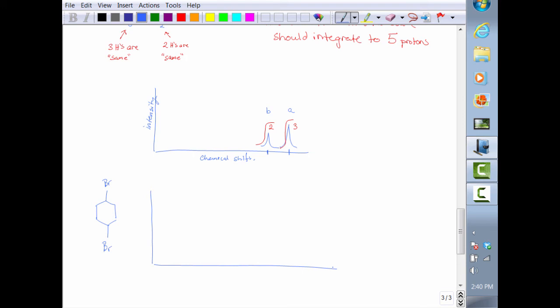There's actually only 2 types. There's the hydrogens that are attached to the bromines. I'm going to call those A. And then there's the hydrogens that are these CH2 groups, and they're all actually the same. They're the same because all of them are 1 carbon away from one bromine and 2 carbons away from the other. So if you were a little molecule elf walking around on your molecule, you wouldn't know the difference between the different CH2 groups. So I'm going to call those purple ones B.